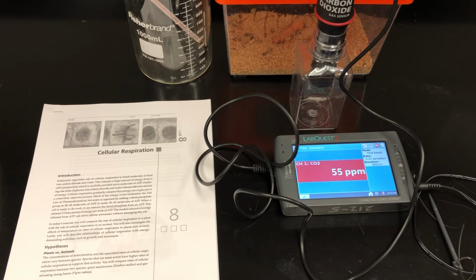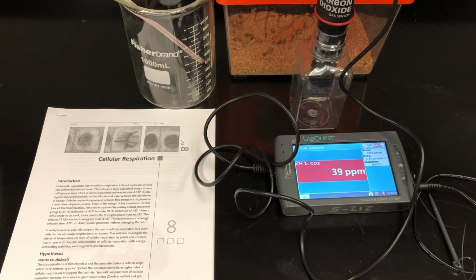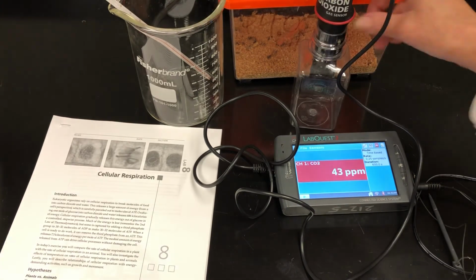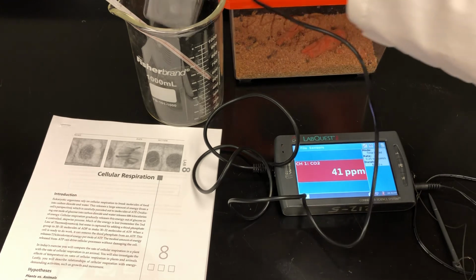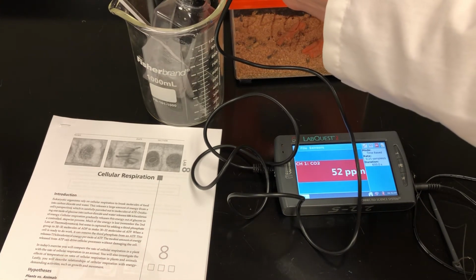Now, we're also going to run this at 2 different temperatures because we want to investigate how temperature can affect metabolism or the rate of cellular respiration. So we're going to be using water baths here. We'll run the experiment at room temperature, and then we're going to set up a cold water bath here, and we're going to take our organism, whether it's the bean sprouts or the worms, and put them into this cold environment and run the experiment again.